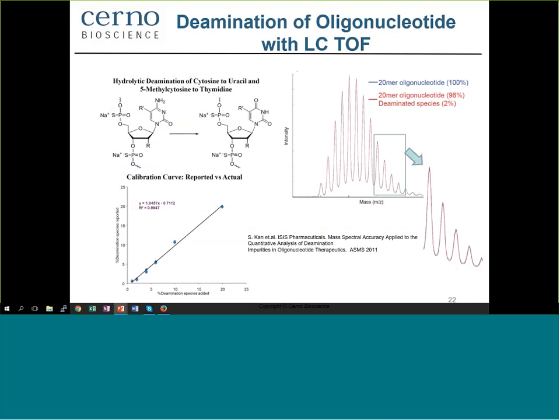Okay, let's move on to another interesting application of mixture analysis. And again, we can do this mixture analysis not only on ions that are resolved, like we saw in the previous example, but even if they're overlapping, we can still do the fit, because the different ion species each have a unique fingerprint, and we can deconvolve, or basically unscramble, that mixture using this approach. We know exactly what the spectrum should look like, because we've calibrated to a known line shape, and that's so important.